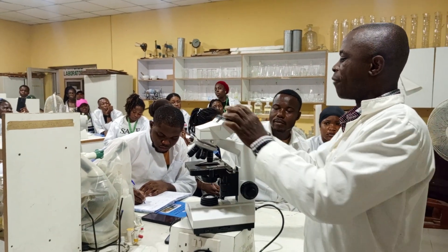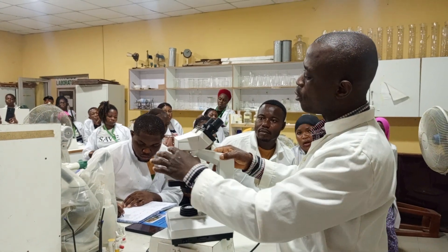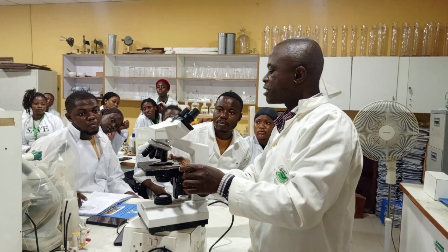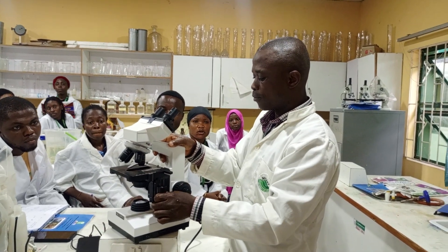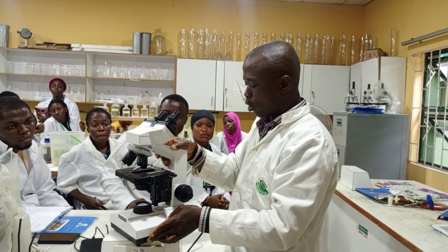The parts of the microscope: we have the eyepiece, we have the body tube, and we have the revolving nosepiece that houses the objective lens. We have the stage clip that holds the slide — you put your slide on the stage. We have the stage adjustment knob that moves sideways, front and back. Then we have the light source.